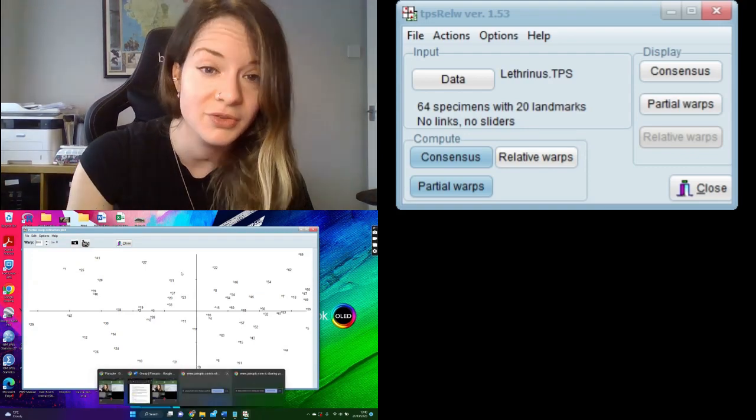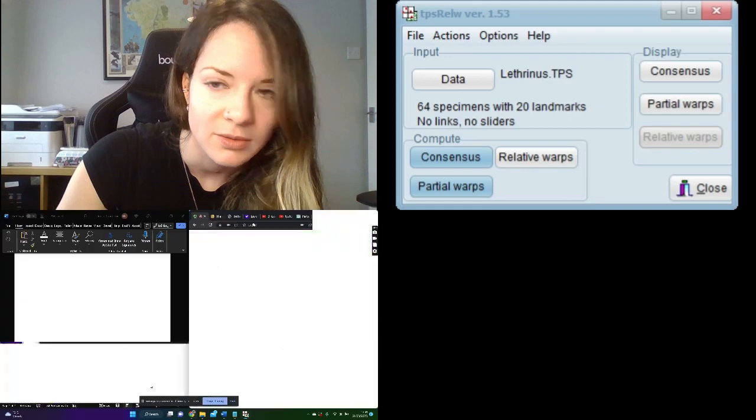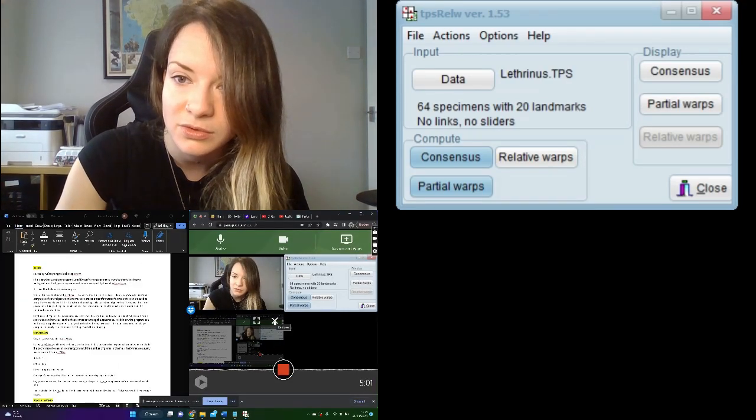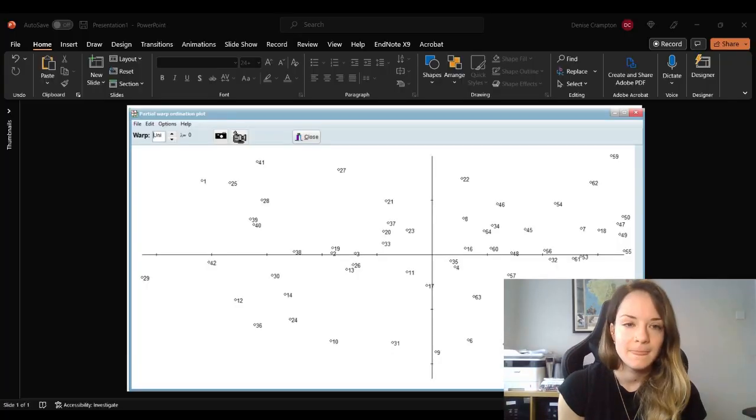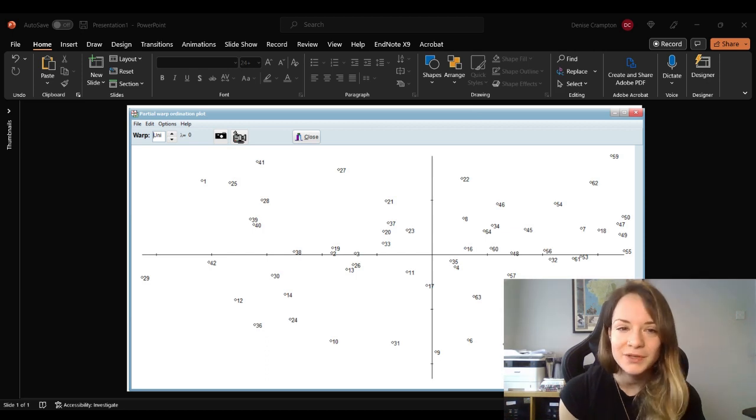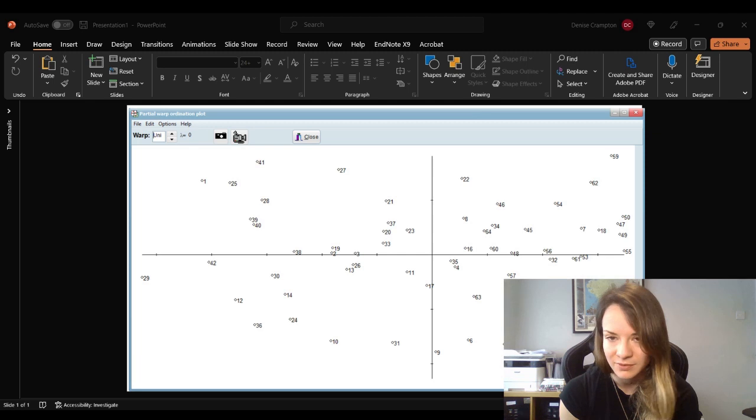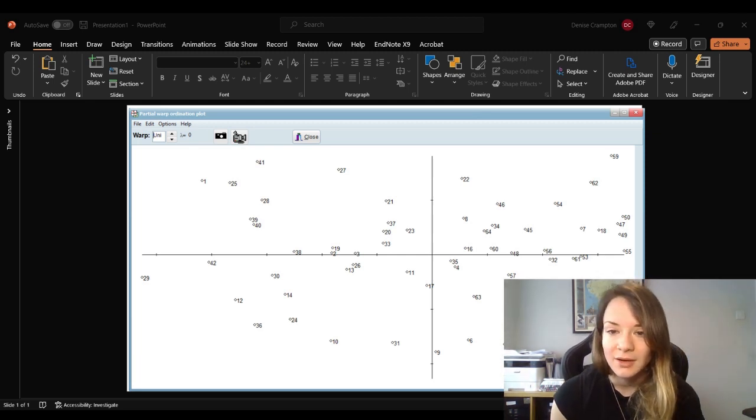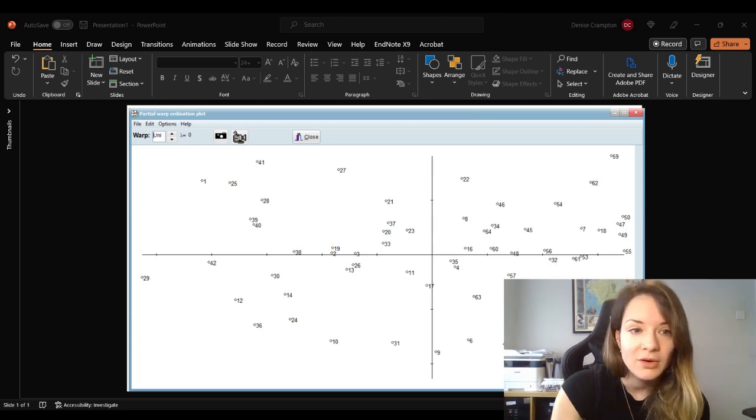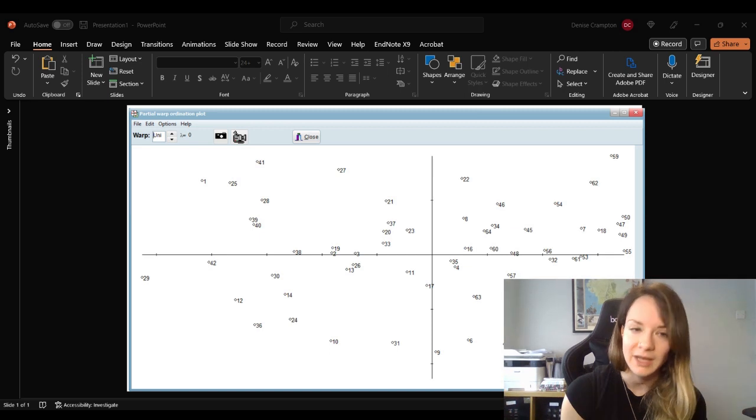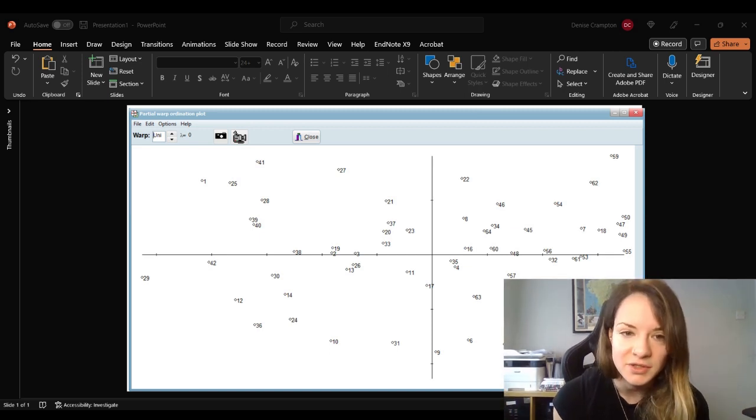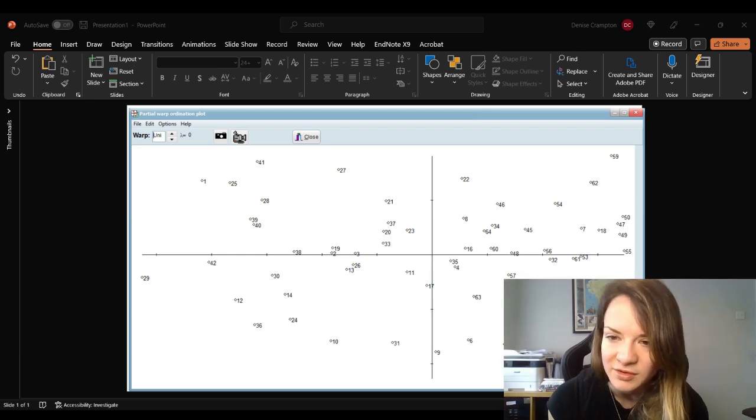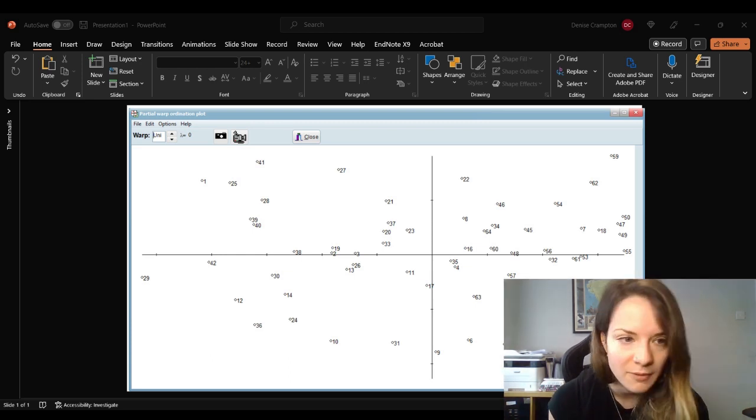So I'm going to talk you through what this actually shows. I've just quickly screenshotted that because it won't allow me to share the plot window on TPSRLW. So as I was saying, each of these points represent the specimen, and the positions of the points in the plot reflect their positions in high dimensional space defined by their partial warps. So the closer together the points are in the plot, the more similar the specimens are in their shape.